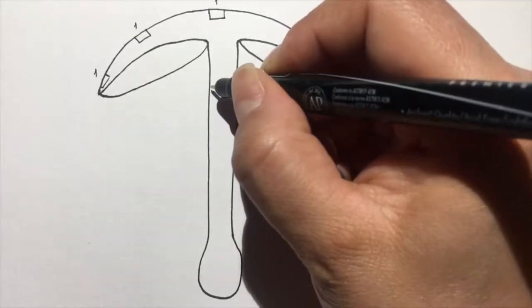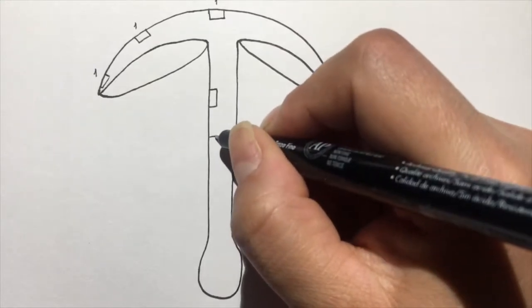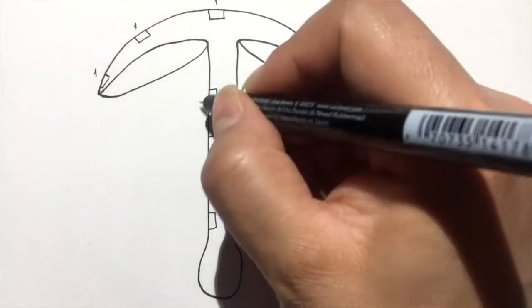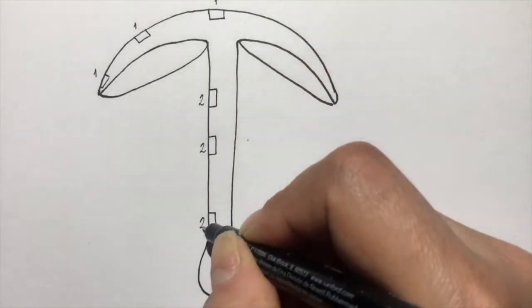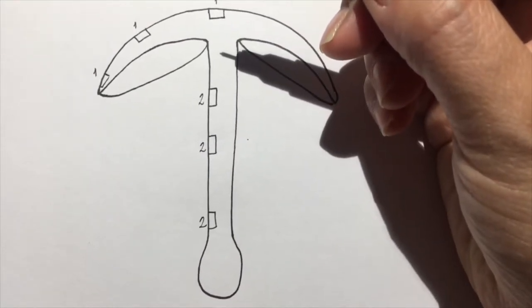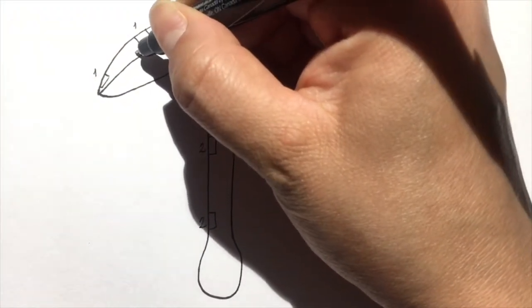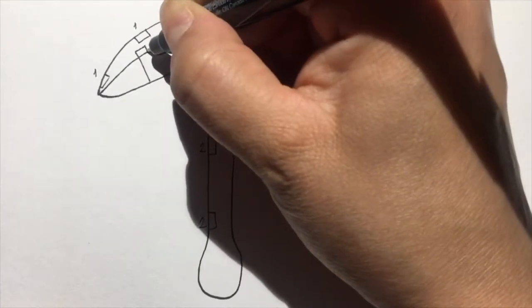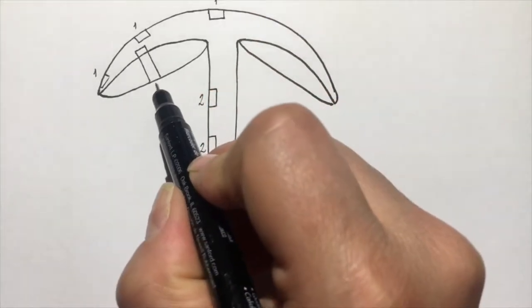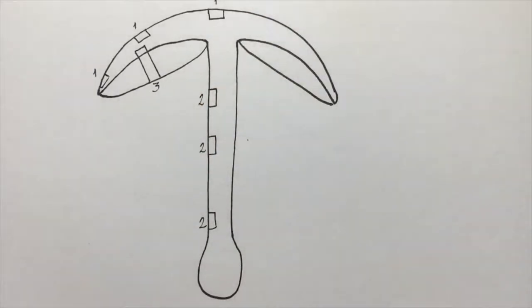The other possible cuts you will do are from the stipe, and you may have to go to different places depending on what you're looking for, and we're going to mark this as two for stipe. And then last but not least, the gill tissue, where you still want to grab, if possible, some of the pileus context, but most importantly, you want to be sure that you've taken the gill edge, and we're going to mark this as three for the gill tissue.